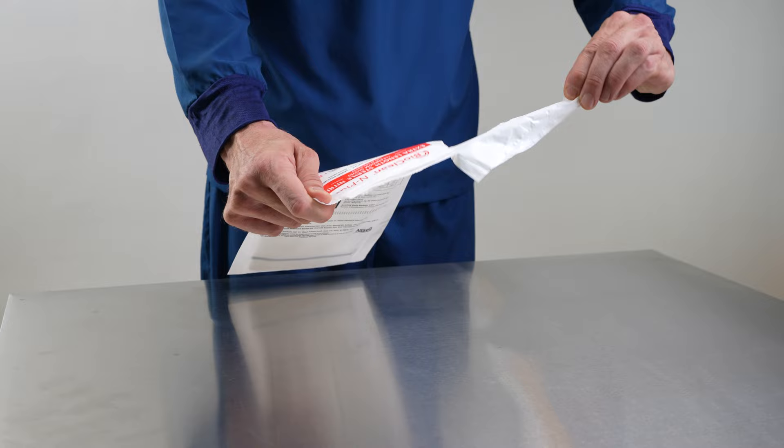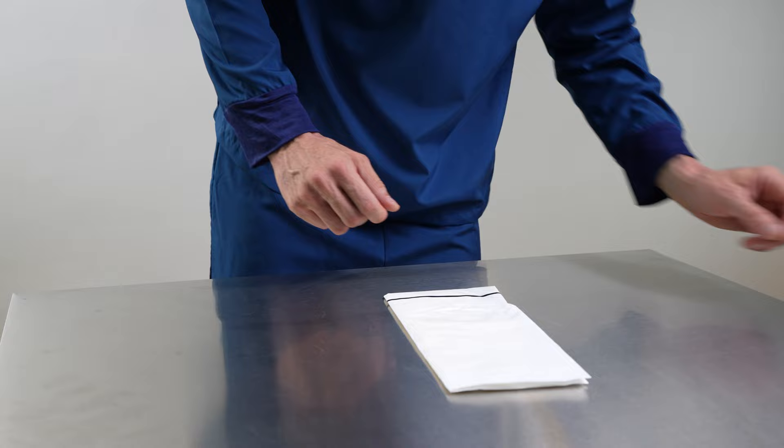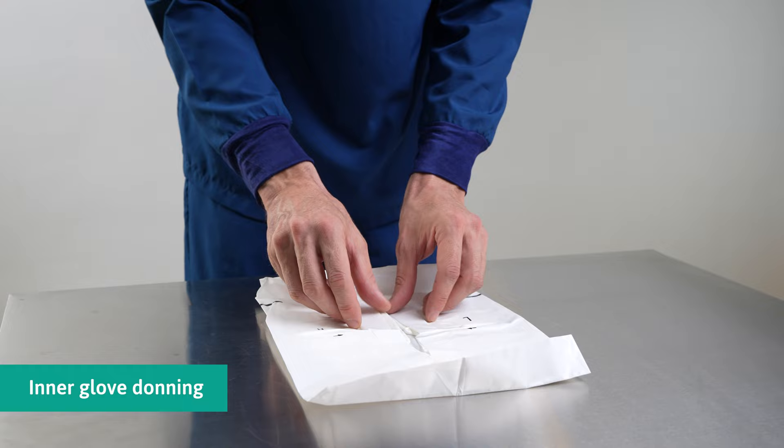Carefully retrieve the content from the packaging. When donning, avoid bare hands touching the external surface of the gloves.